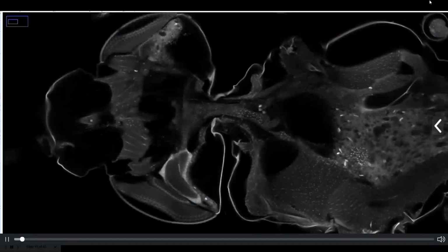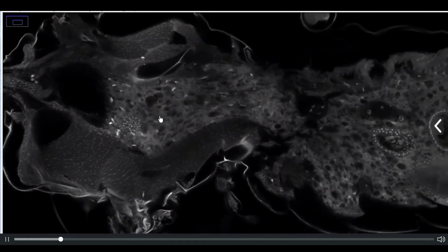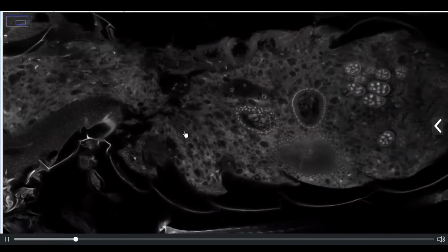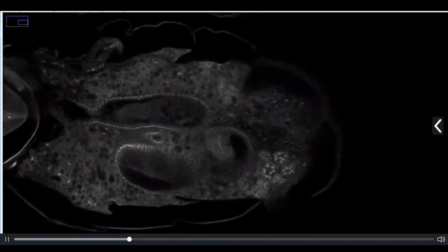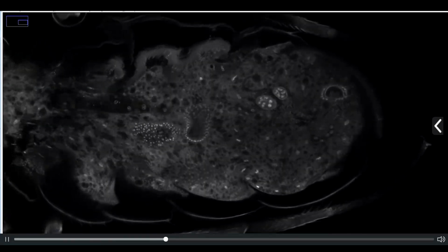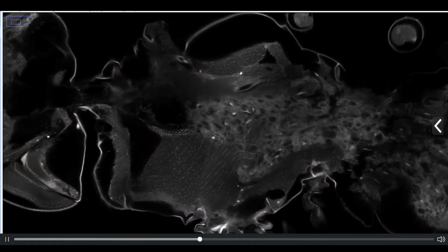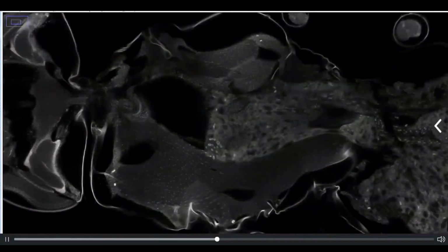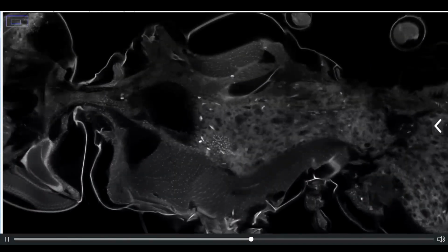So this is just a screen grab of me having a little look through the raw data in ImageJ. So let's pan down to the end, or at the thorax end, in the abdomen. Yep. So we can now simulate focusing. We know it's a female fly because these are the ovaries here and here, these giant nuclei, and we can pan back up through the thorax. We've got rows of flight muscle here, here. These are sections of leg. We can pan through the cardia.